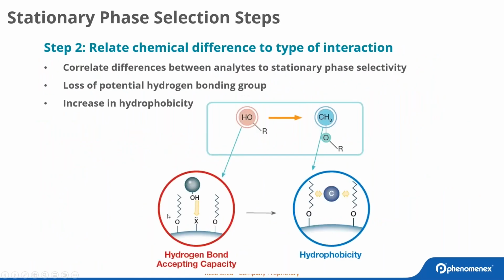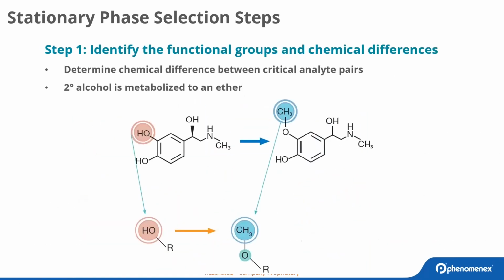So when you look at these different stationary phases, right, you can kind of, skipped ahead, I think. Step one. It's important to start at the right step, right? So here are a few of the different selection steps that you can take to pick a good phase to start with, right? And that will impact your selectivity.